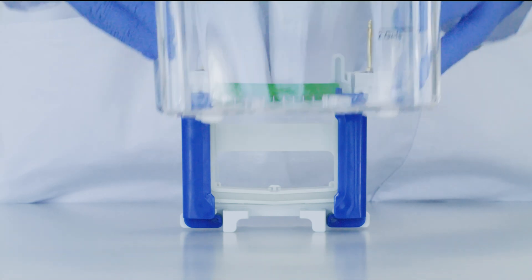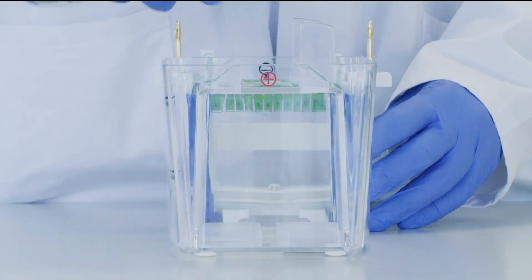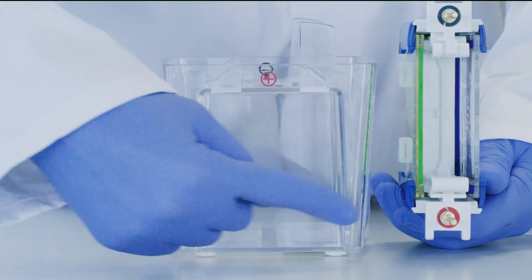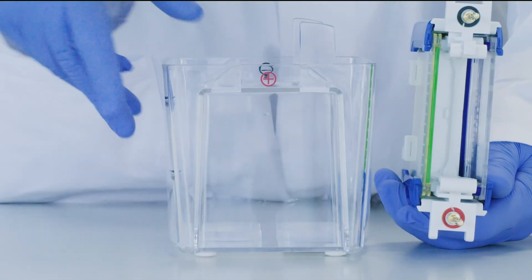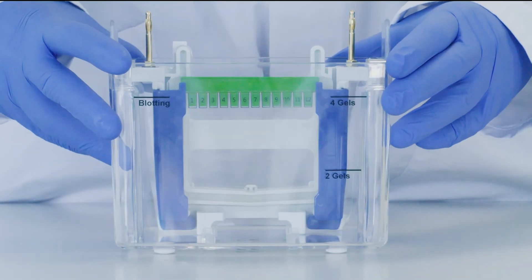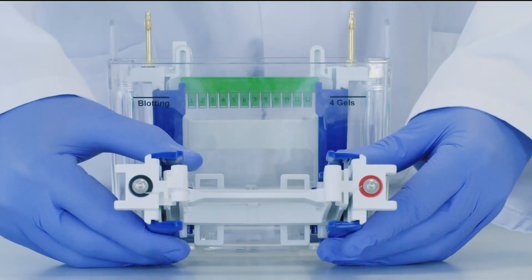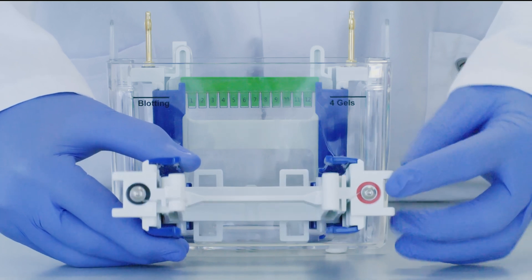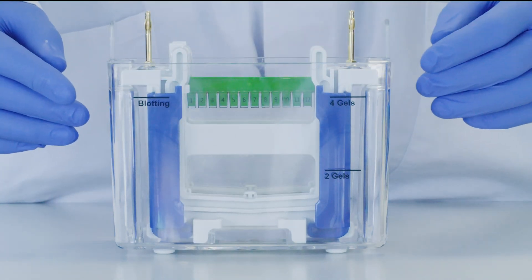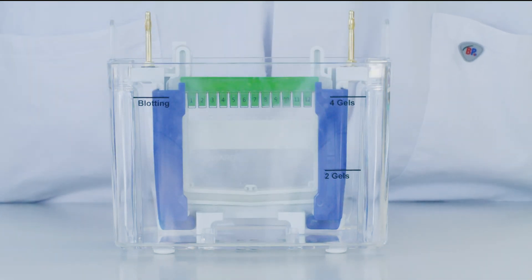Now select the GIL chamber tank from the GIL electrophoresis components. The tank has one electrode mark on each side: the positively charged anode in red and the negatively charged cathode in black. Match the red and black marks of the inner electrophoresis chamber to the red and black marks of the tank, and insert it, hanging it on the side with the two plastic humps. If three or four GILs are used, select the inner electrophoresis chamber with short electrodes, repeat the insertion of sealing strips and GILs, and insert it with matching colors into the remaining spot in the tank.